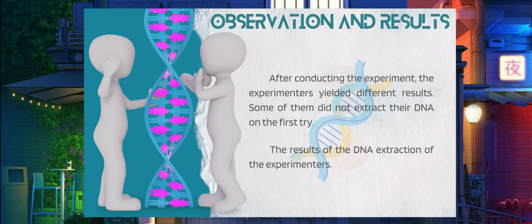The procedures weren't followed properly, such as the salt in the water wasn't dissolved properly and the dishwashing liquid wasn't fully stirred. The experimenters also used alternative materials such as plastic cups and spoons rather than pipettes and test tubes. This could affect the extraction and the transport of the DNA. Lastly, due to technical difficulties, the alcohols of the experimenters have gone to room temperature.